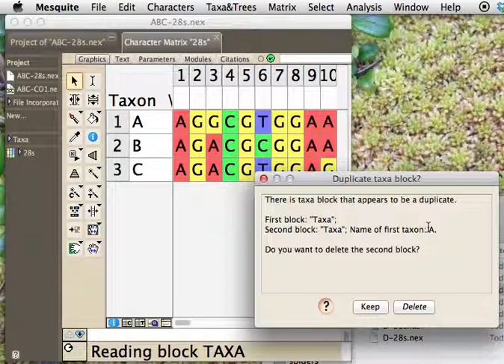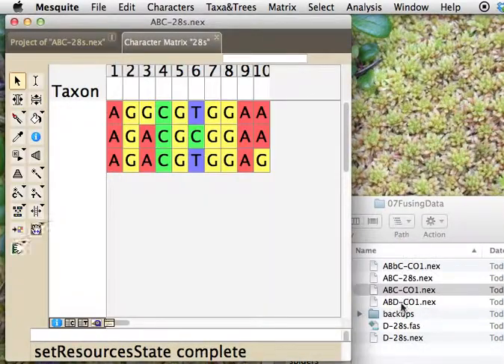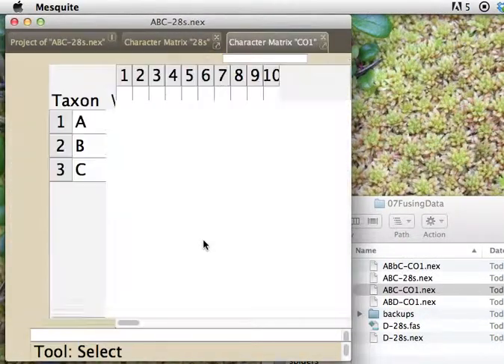And it says, hey, I think that these two taxa blocks, the one in the new file that we're reading in and the old one, look the same. Do you want to delete the second block? And if you delete the second block, it'll basically be reading in all of the matrices and information as if it belonged to the block of taxa that were already in your main file. And so, in fact, we want to delete it, because now it pulls it in.